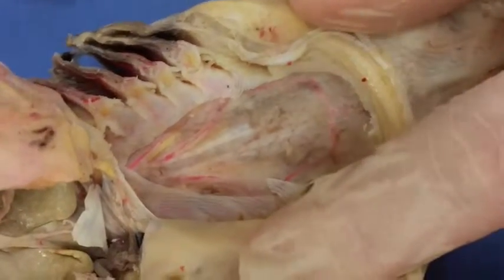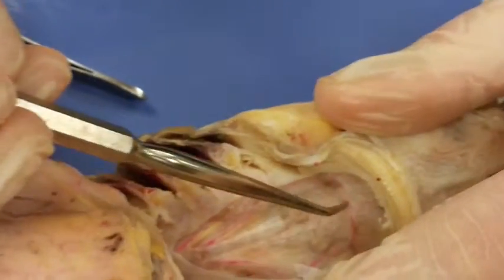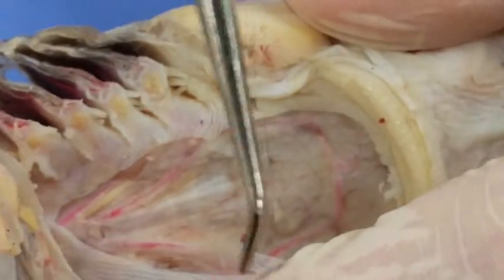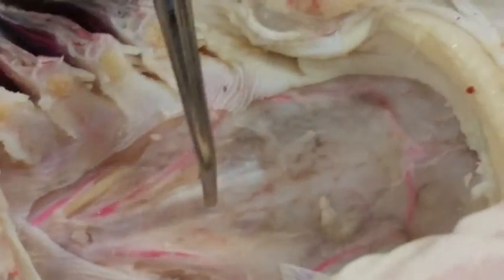Okay, so looking up in the oral cavity, we have the internal carotid arteries up here at the top. Internal carotid artery. Leading down on either side is hyoidian artery. Running up the middle, extremely faint in our specimen, are the paired dorsal aortae, but they run right along through there. Underneath this white ligament type of material, you can just faintly make out the branches of the efferent branchial arteries.